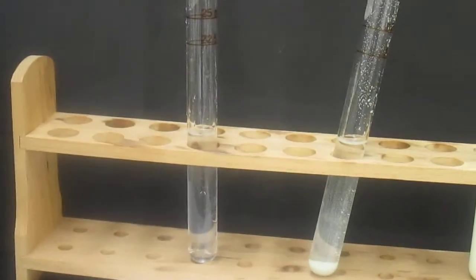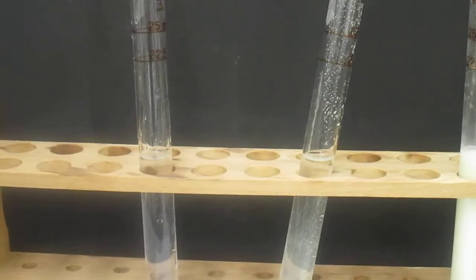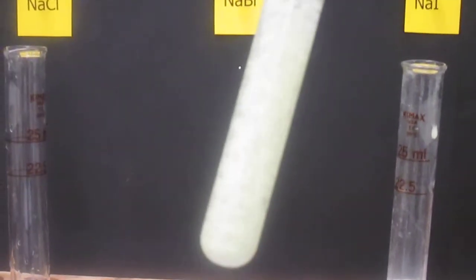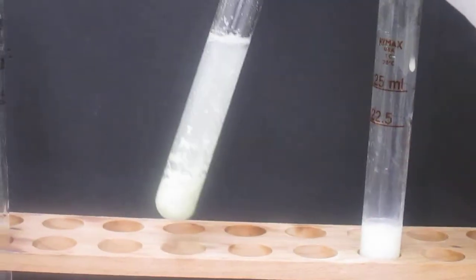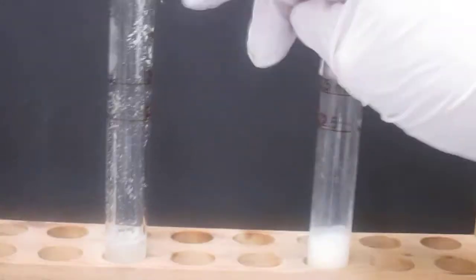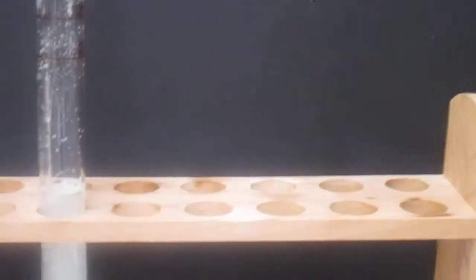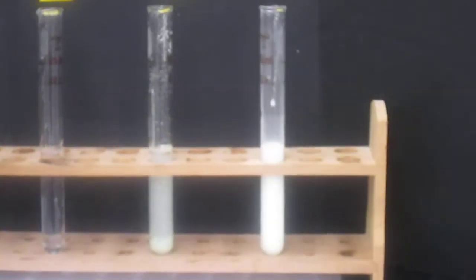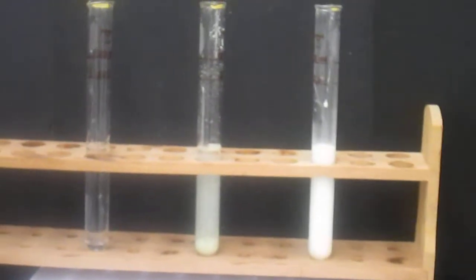And voila, sodium chloride is all gone. The silver chloride has disappeared. So that one is going to be considered... choices are soluble, slightly soluble, insoluble. All right, let's look at our sodium bromide. Let's see what happens now. Still dissolving. We're losing some, but not a lot. And lastly, our sodium iodide. We're just not losing hardly anything there.